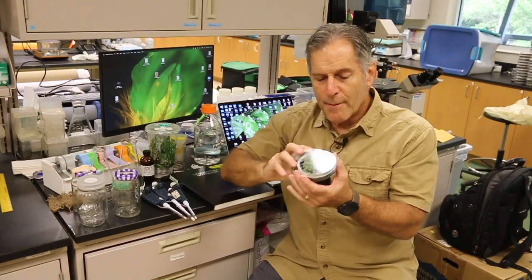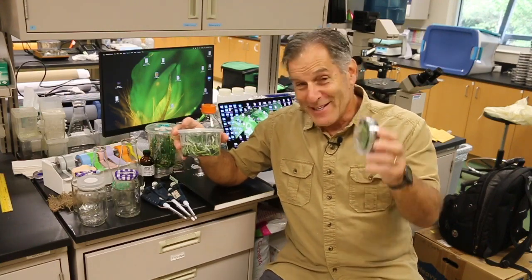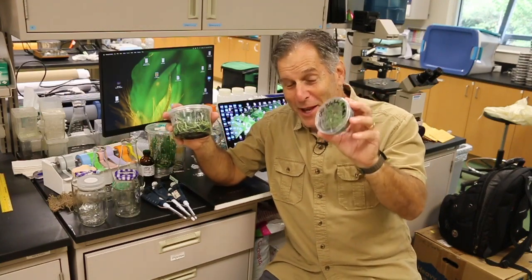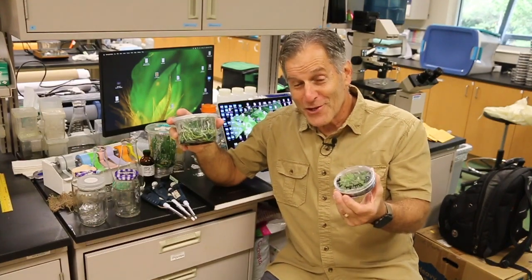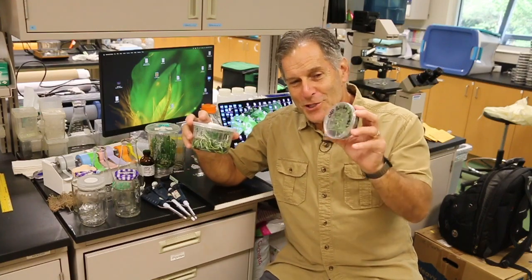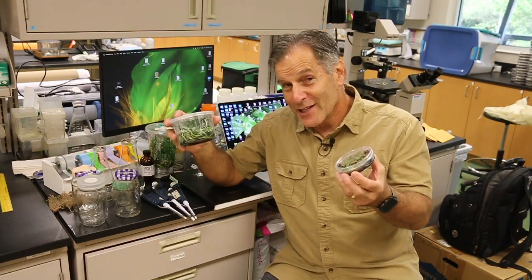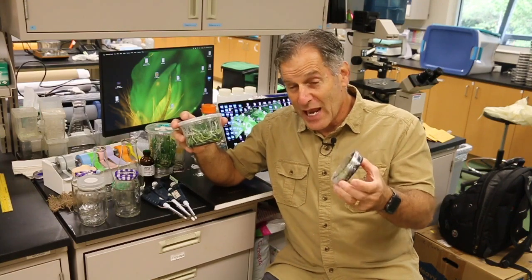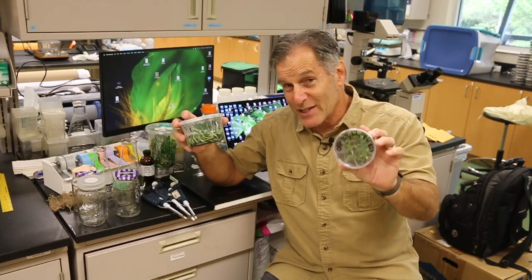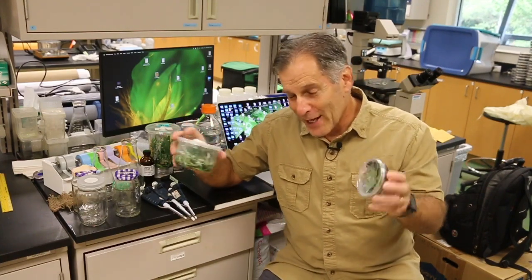All right. This container, I think you obviously know, is a petri dish. But what you may not know, and I know because I worked with these for years, and I worked on modifying these for years for some of the work that I was doing, is that this was named by another German guy, Julius Petri. So when you spell out petri dish, the P on Petri is capitalized because Petri was the name of the guy that developed the petri dish. Anyway, little side story there.